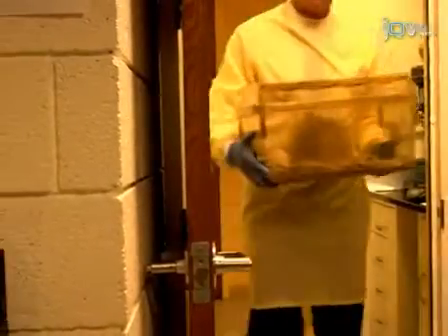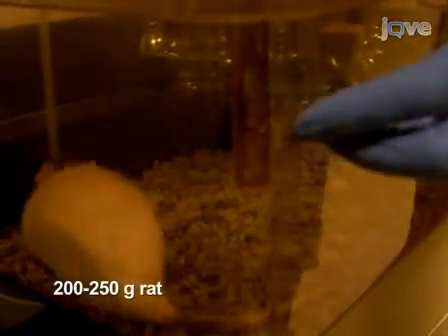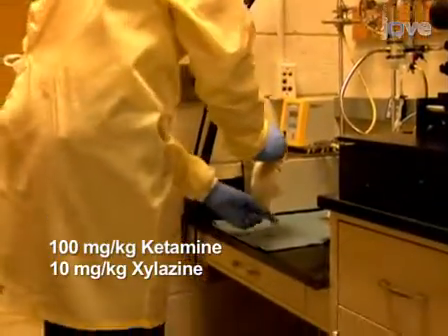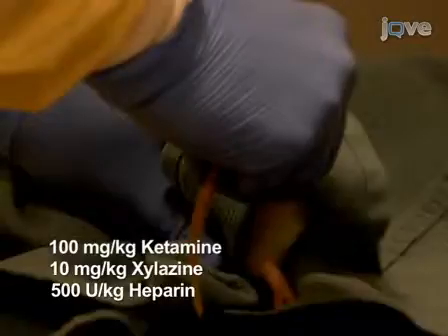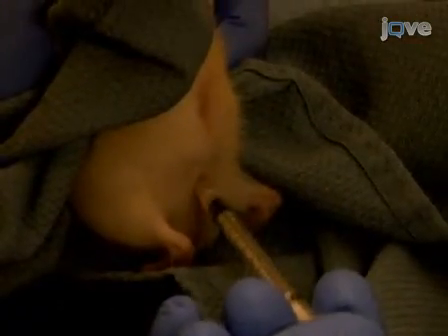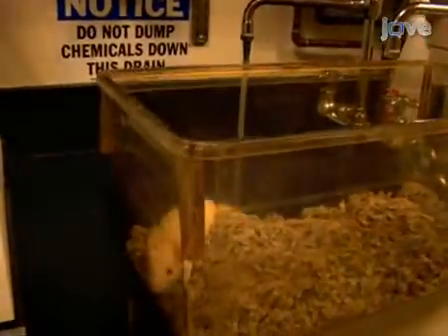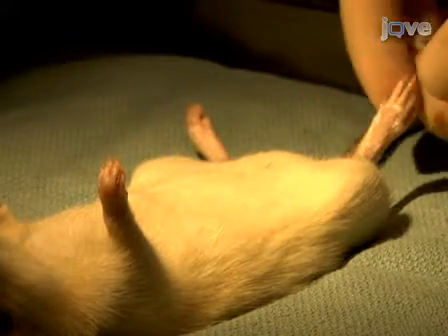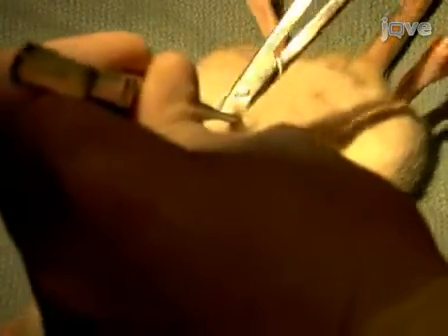To harvest the rat heart, first intraperitoneally inject a 200 to 250 gram Lewis rat with ketamine and xylazine to induce deep general anesthesia, and with heparin to prevent blood coagulation and myocardial ischemia during explantation. Once the rat is completely anesthetized and does not respond to a toe pinch, proceed with removing the heart. Begin the surgery by first removing the anterior chest wall to easily access the heart and great vessels.